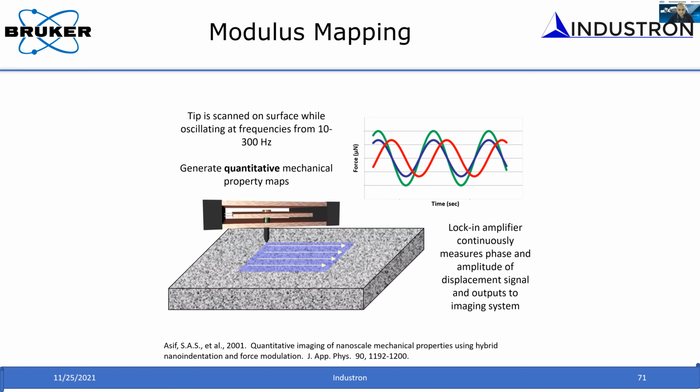On porous materials, you can measure the densification. As you apply the stress, you can measure how the material is densifying. So there are a lot of things you can do with the nanoindentation technique beyond hardness and modulus measurement.